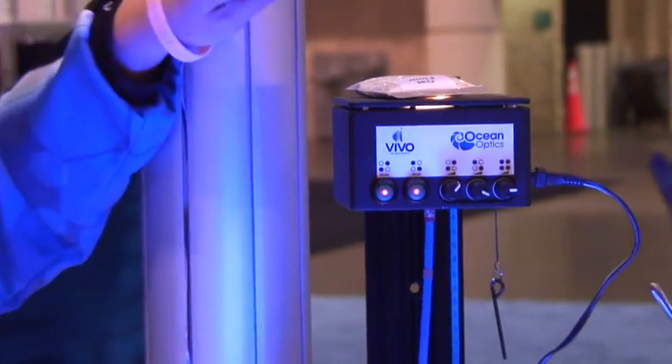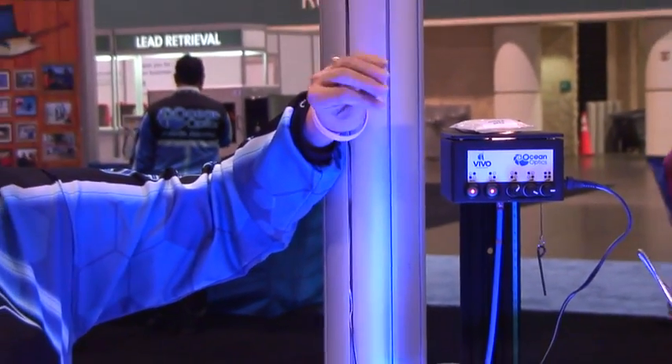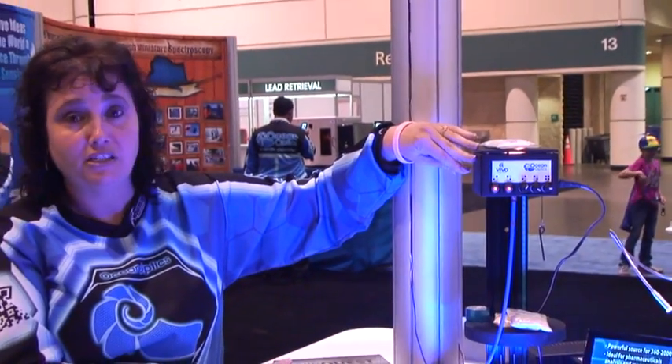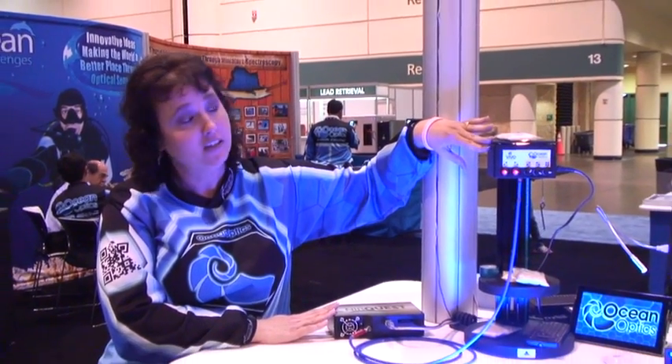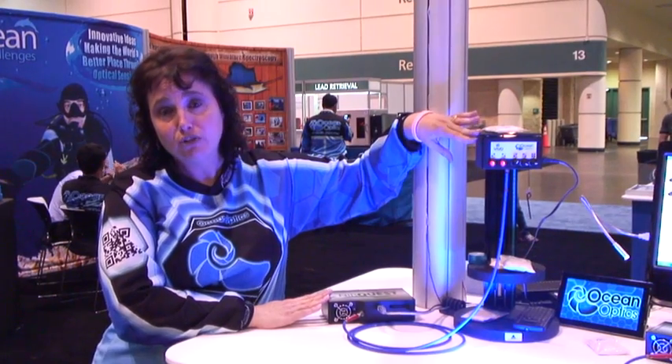Since we're not fiber coupling to the sample, we get rid of a lot of the attenuation that you typically see with fibers. So the combination of the NearQuest and the Vivo are a great combination for your measurements. See it online at OceanOptics.com.